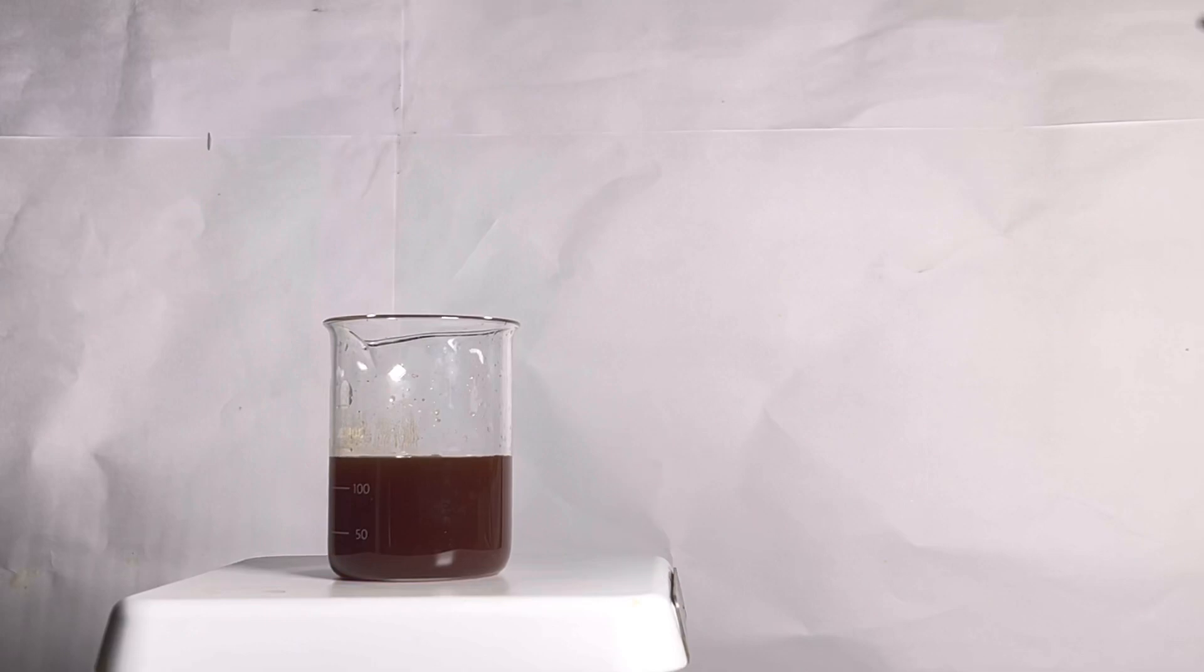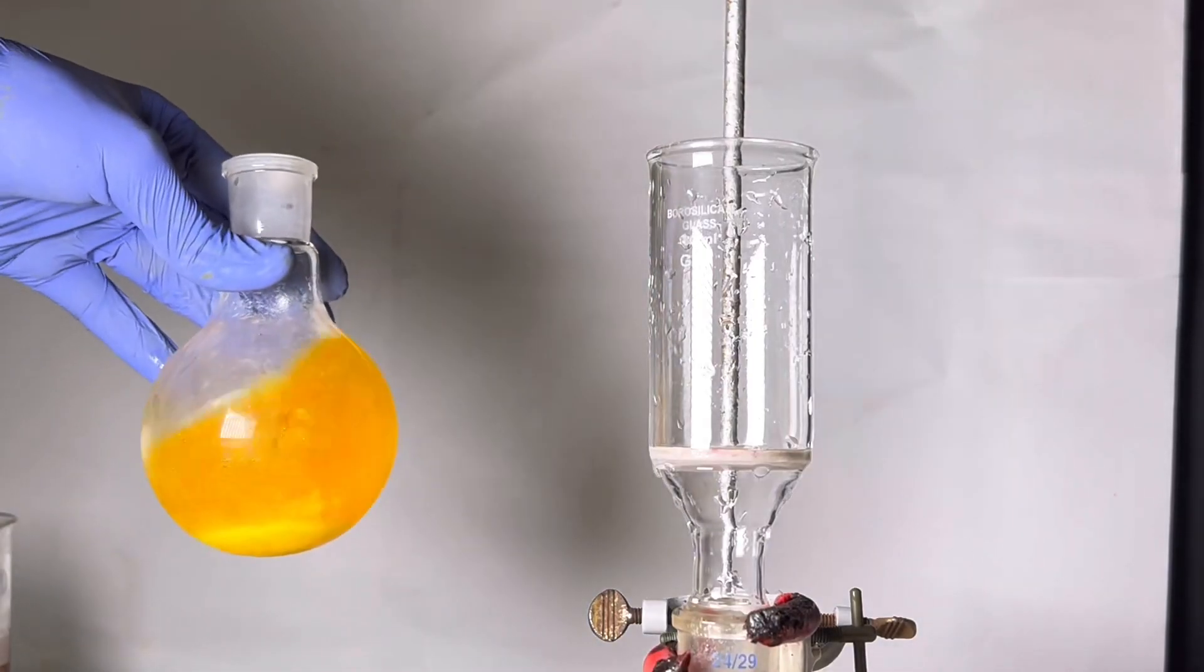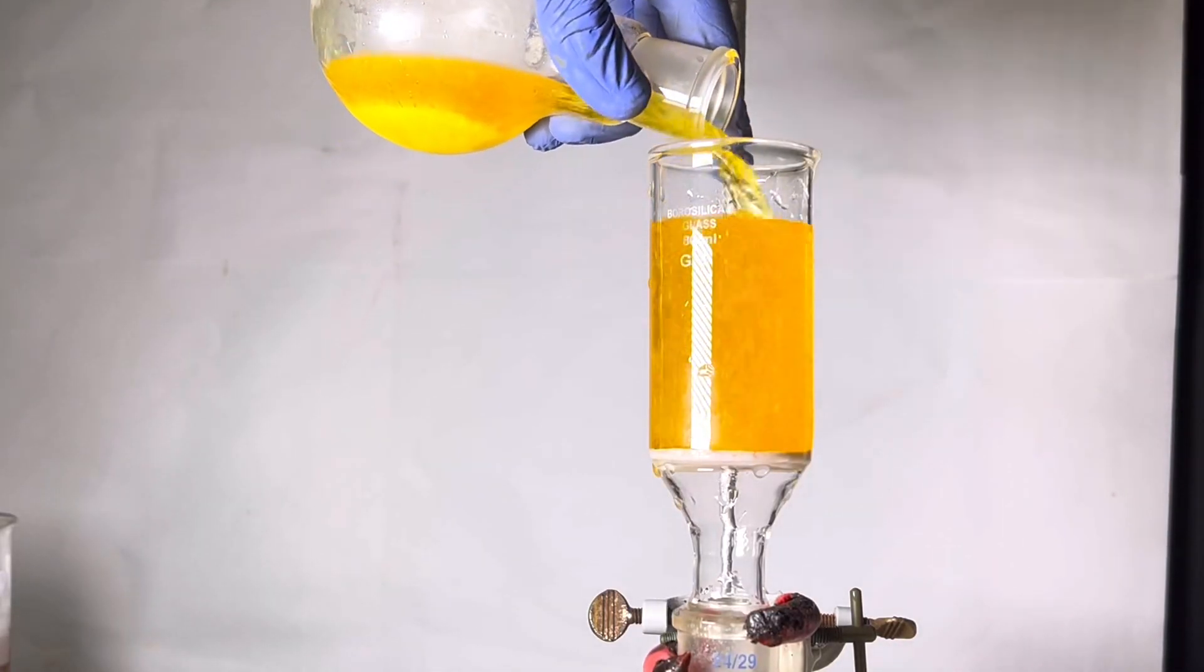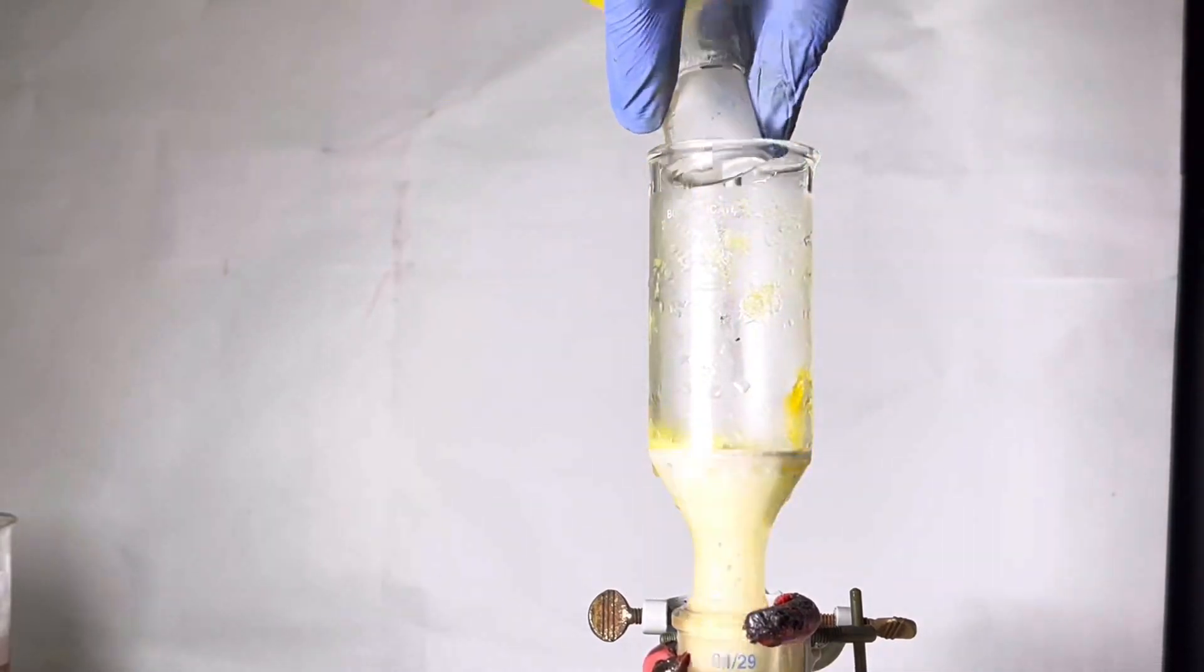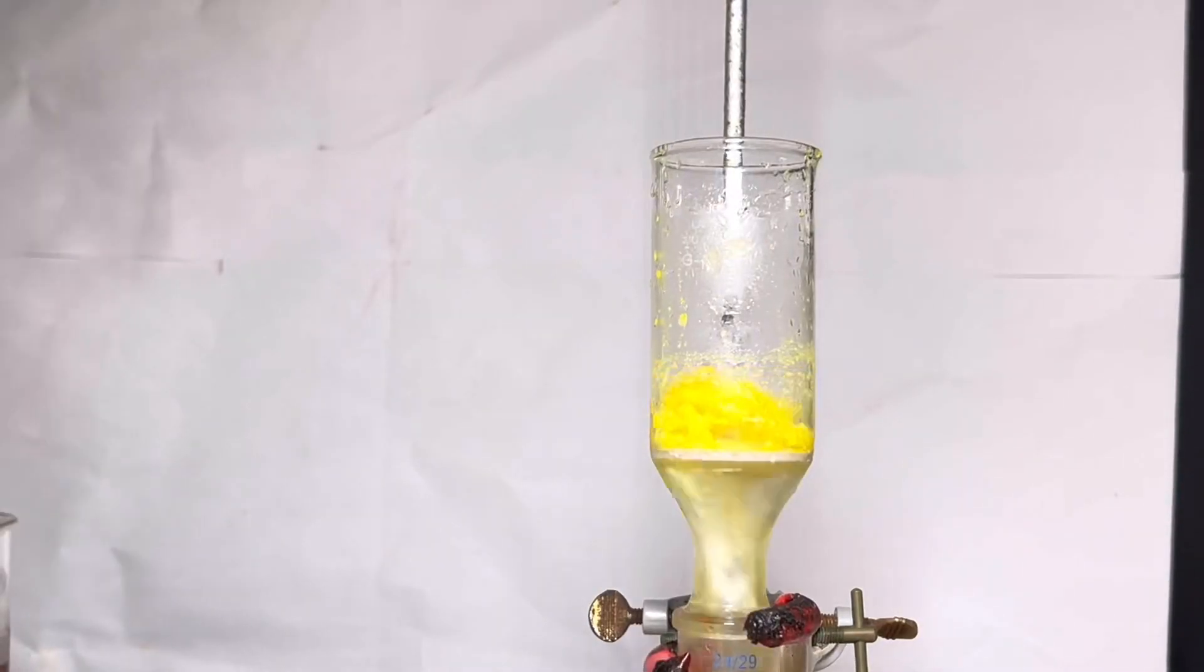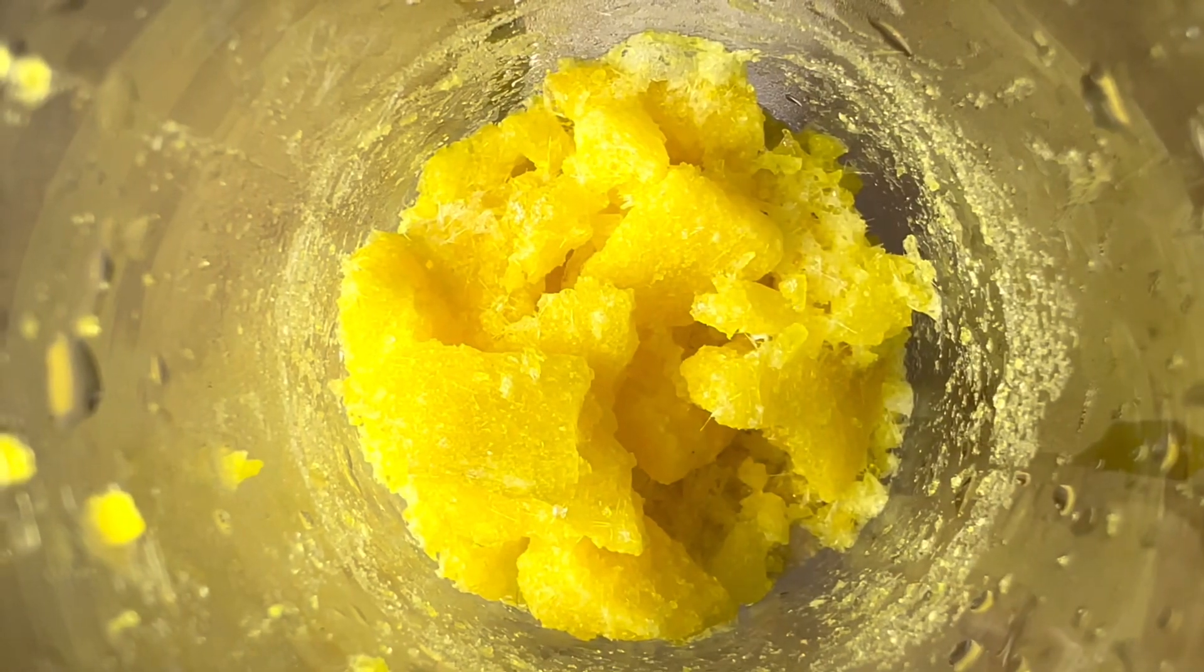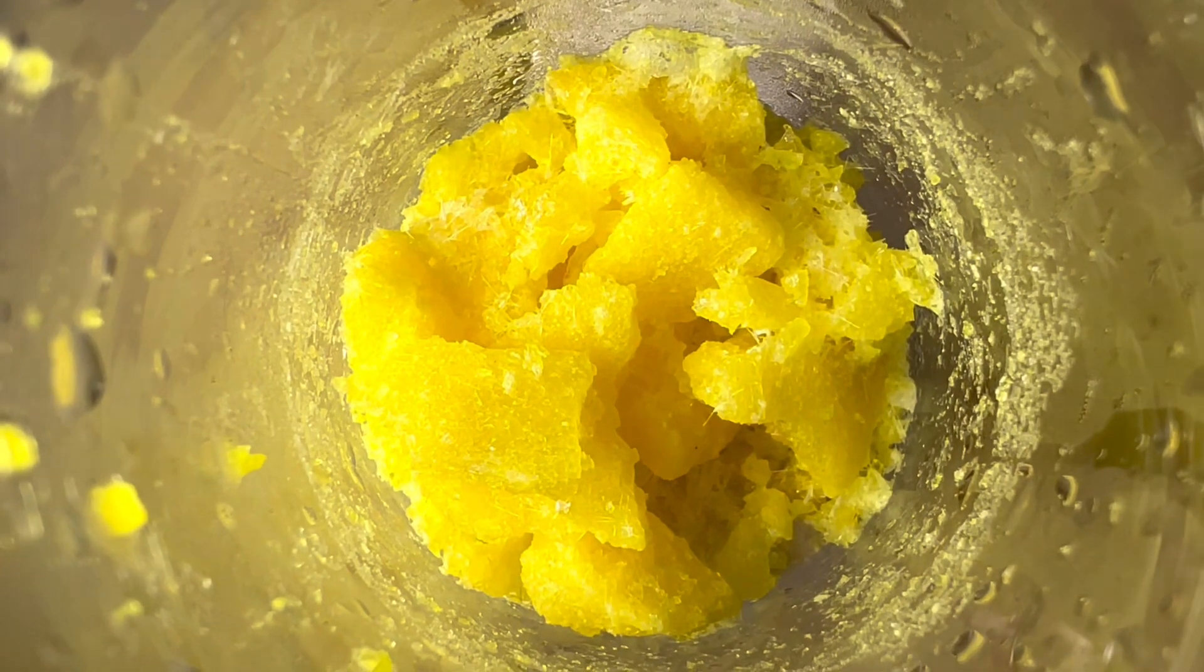The next day, both the beaker and the flask have crystals in them. First, I filter the ortho-nitrophenol. It has some nice yellow crystals. The flask was washed with a little bit of cold water to transfer everything to the Buchner funnel. This is the ortho-nitrophenol that I obtained. It was then transferred to a vacuum desiccator to dry.